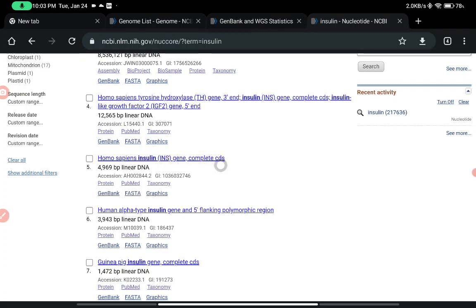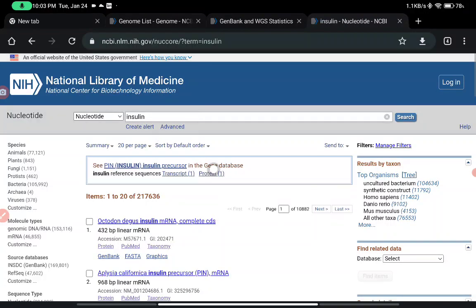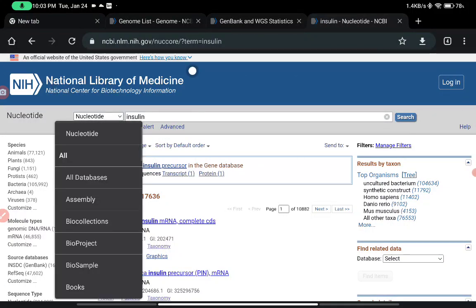The complete coding sequence, that is CDS, is available. I can either go for the FASTA sequence or GenBank. This was the first method — using the main database to search by name.